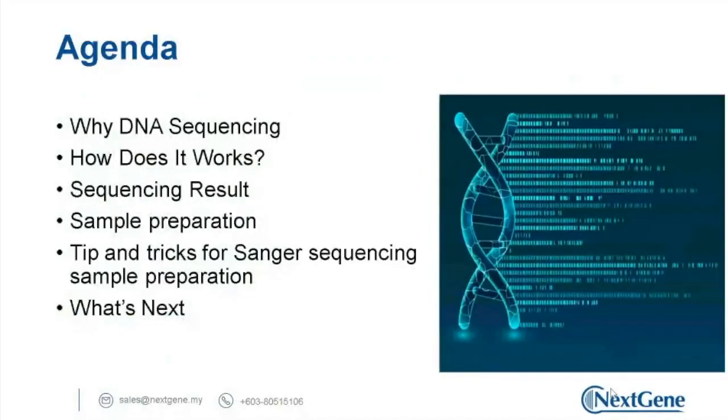Okay, so first of all, I would like to show you the agenda of today's sharing. At the very first part, we will share on why DNA sequencing, and then after that, how sequencing actually works, what is really happening, because a lot of times we outsource the sequencing. I'll give you a little bit more information on what happens in the sequencing house.